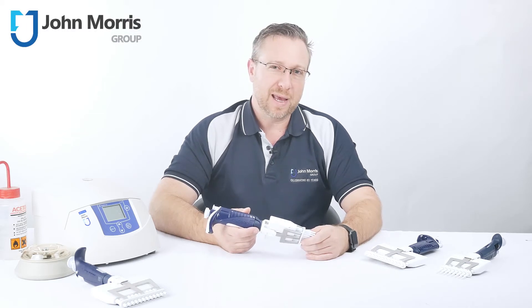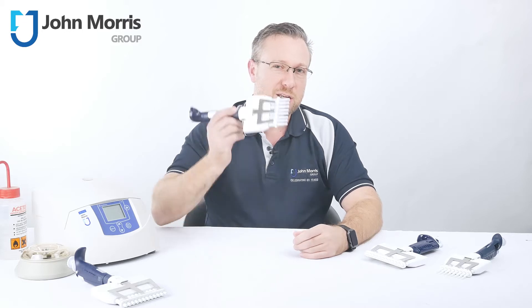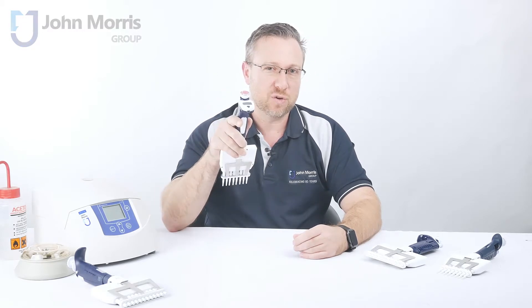If you're all about multi-channel pipetting and really care about ergonomics, accuracy and precision, this short product review is just for you.